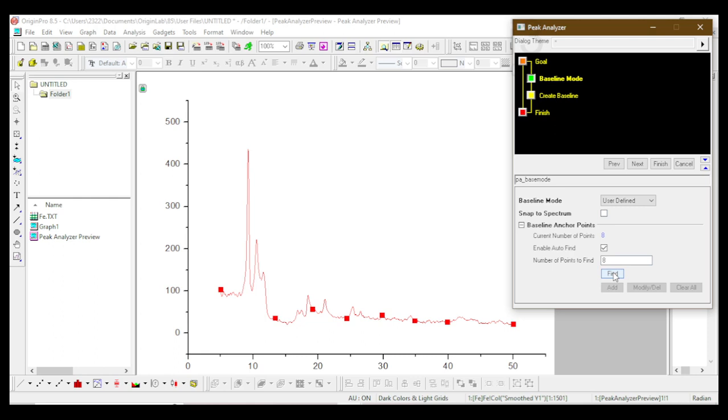I do not want it to take up a lot of time because we have got a lot of things to do. I wanted to finish off the video in at least 15 to 30 minutes. Find, I'm not satisfied with the baseline. I'll do a correction. I'll give next.